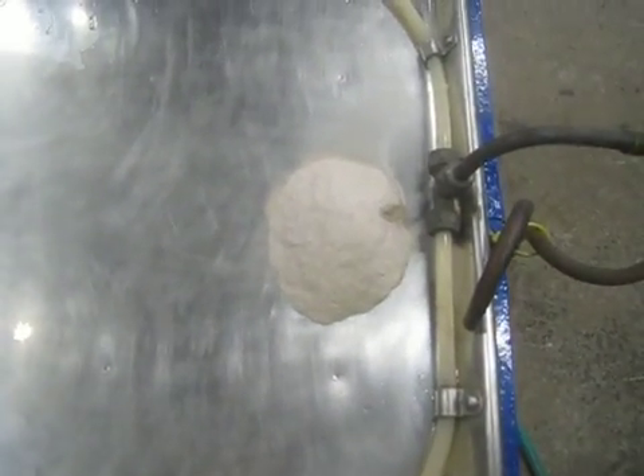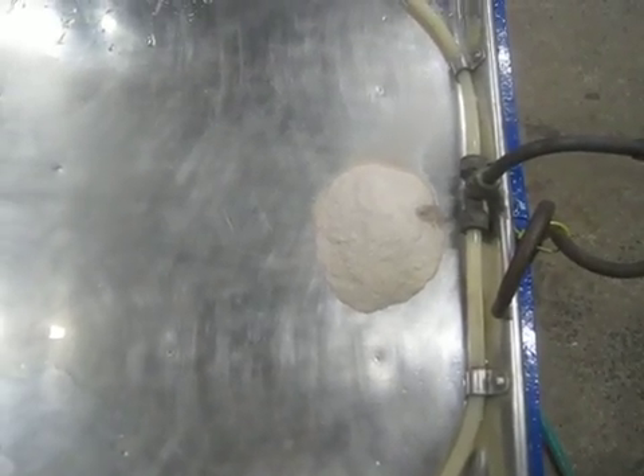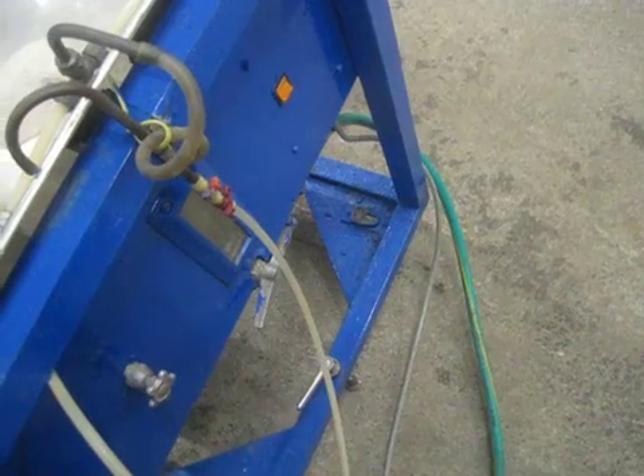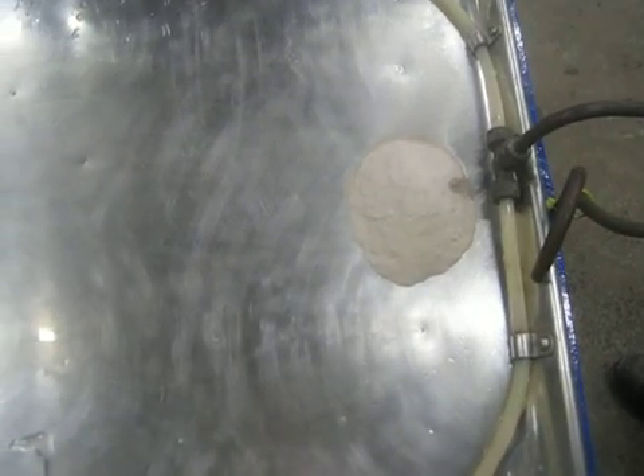We have approximately 100 grams of sample at the head of the flat tray. We have set the tilt angle to approximately two degrees and we are now going to fully damp wet the sample down.